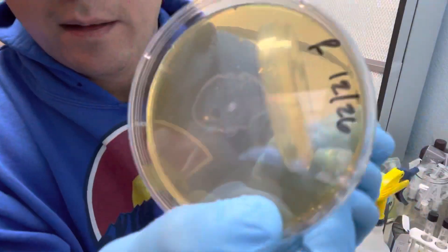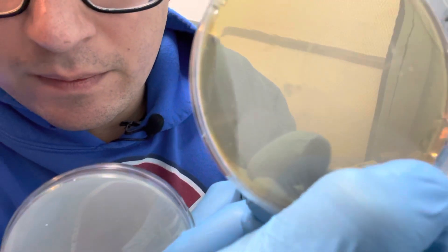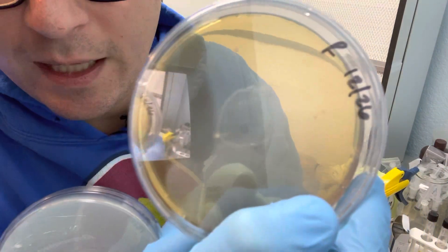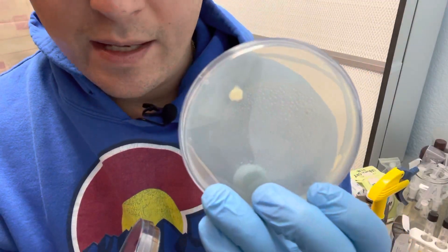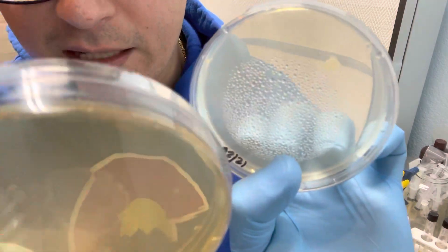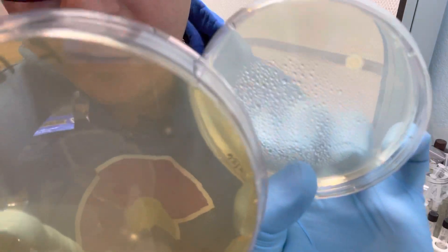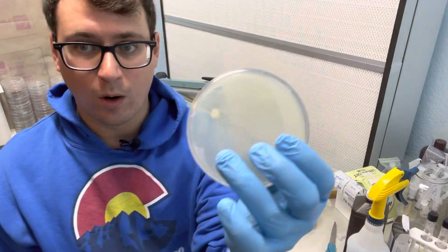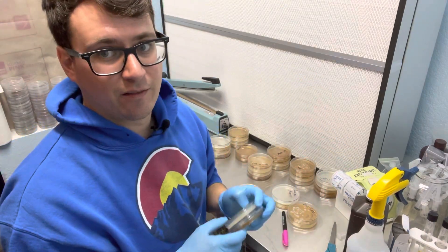Another really good example of some mycelium here — you can notice the spread of all of those mycelium colonies as they germinated. Compared to a bacterial colony, it's kind of amorphic, it still looks white, but if you look really closely it's not as feathery, it's not as transparent. And you'll see very quickly that the mycelium will outgrow the bacteria after it establishes itself pretty rapidly.